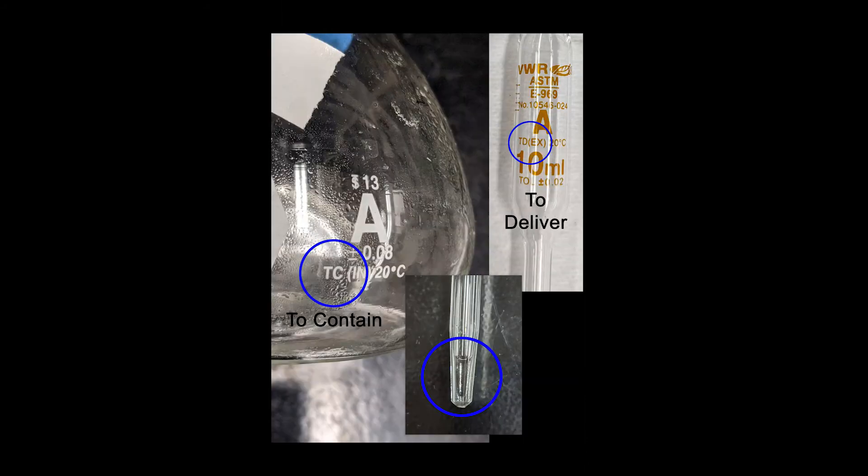Something to note are the designations on volumetric glassware. TC refers to 'to contain' a certain volume, which is usually seen on volumetric flasks. TD means 'to deliver' a volume, as seen on the volumetric pipette.